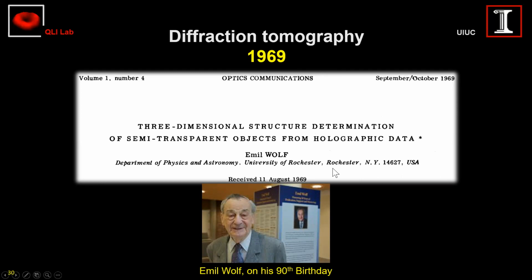So basically, this paper is a pioneering paper that set off the whole field of diffraction tomography. Based on Gabor's holography, Emil Wolf proposed a theoretical model to use that holographic data to extract pure 3D structure object information, which means if you can do that, basically you are getting just the pure structure of the object without the effects of the measurement, the system, or without the artifacts of the imaging microscope.